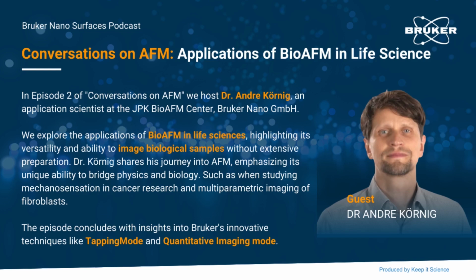And AFM technology, I got hooked by it in my master's thesis, or at this time it was still diploma thesis. So I studied physics and realized that the dry matter and material stuff is maybe a bit boring. So I got attracted by more the life science. So having kind of an impact to something living was quite interesting. And then I went to a biophysical institute in Bielefeld, actually. And there, my first technique was AFM. Then I did a lot of other stuff, but basically the first technique you learn, you kind of get hooked, or I got hooked with.